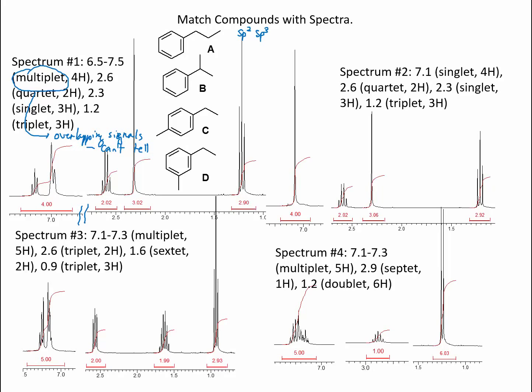Here it's 5 to 2, 4, 7. Here it's also 5 hydrogens at aromatic carbons, 7 hydrogens at sp3 carbons. Here it's 4, and then there's 2, 5 and 8, 4 to 8. And here it's also 4 to 8. So here we have 2 4s and 2 5s for the aromatic region. So we can sort of separate it that way.